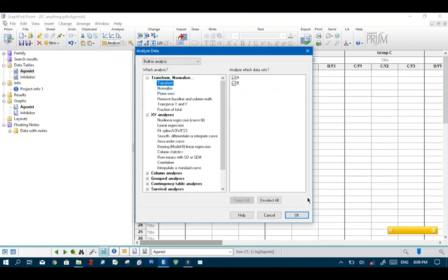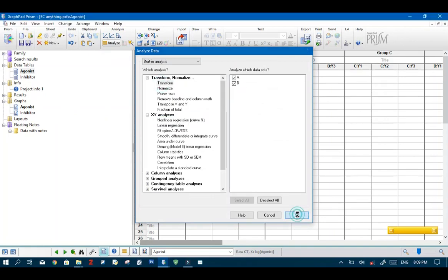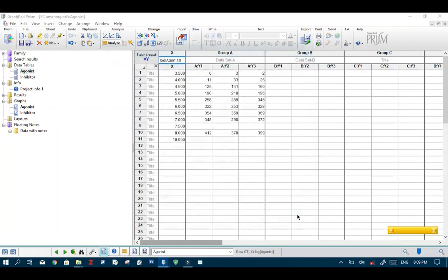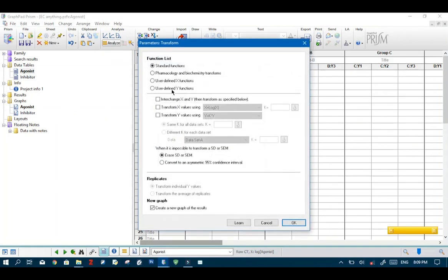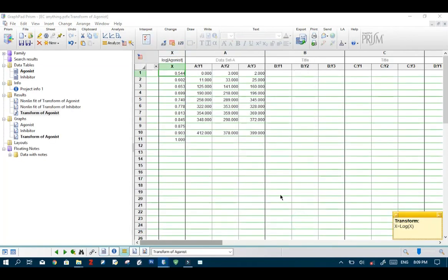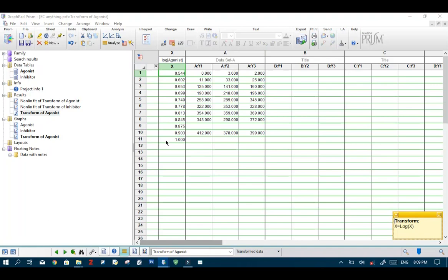Now the next thing you want to do is select transform and hit OK. Now check this box and make sure X equals log X is selected. Hit OK. Immediately GraphPad Prism returns a new data sheet with your log transformed X values.